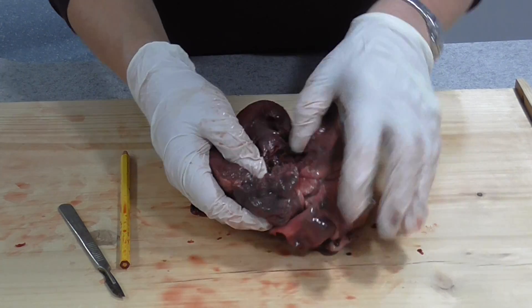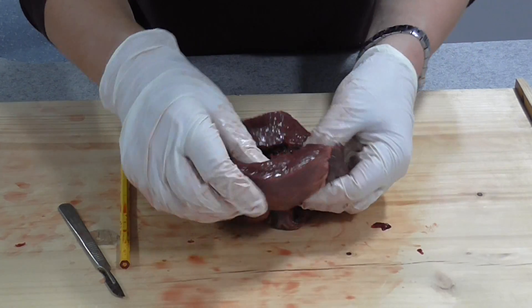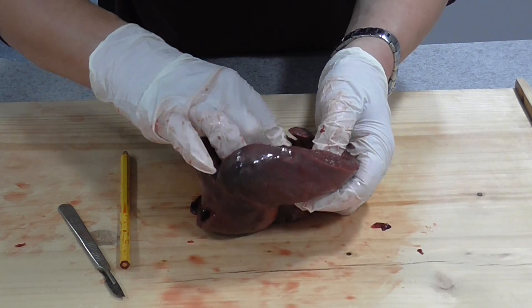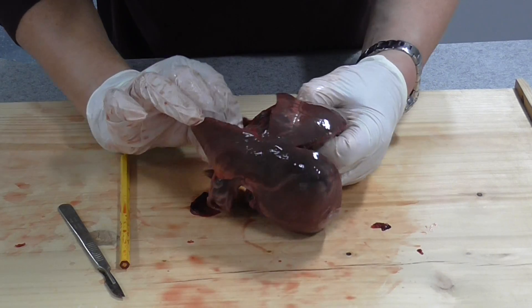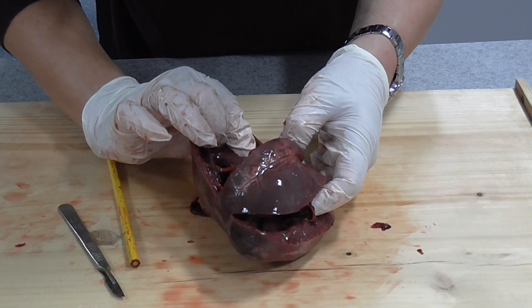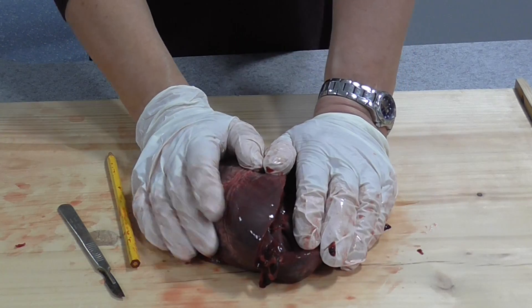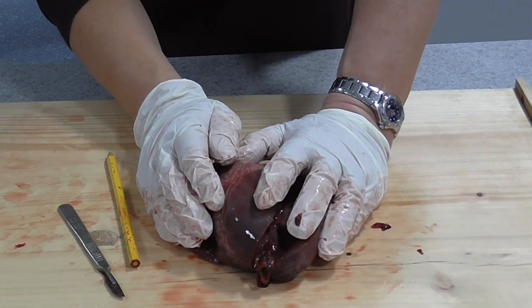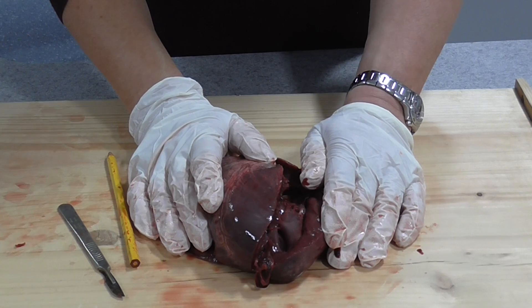That's about all there is really to see in a heart dissection. If you get a very good heart you can sometimes see the semi-lunar valves up at the top, but they're quite damaged on this particular one. It's ideal if you can get hearts from somebody who rears their own animals, so they can leave them intact with all the blood vessels - but they are very difficult to get hold of.